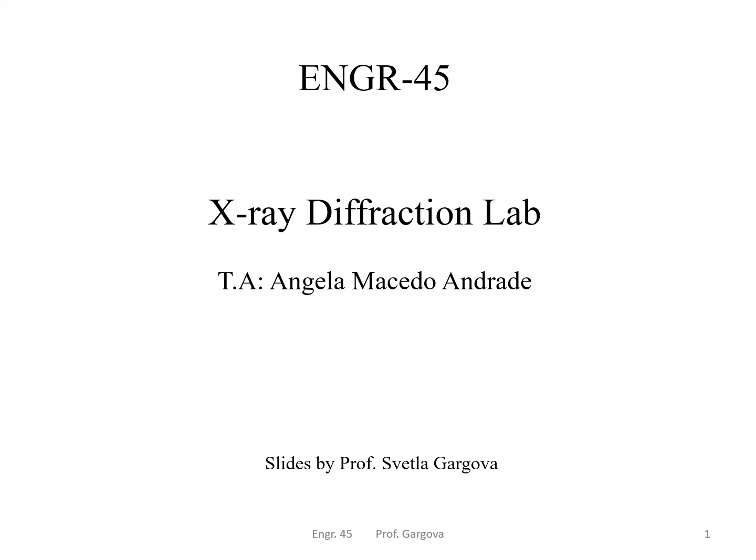Hi everyone, today we're going to go over the X-ray Diffraction Lab, or XRD lab. XRD is a tool that is used to try to piece together the crystal structure of a sample, which is done by determining the d-spacing between planes from the way that X-rays interact with your sample and are reflected.